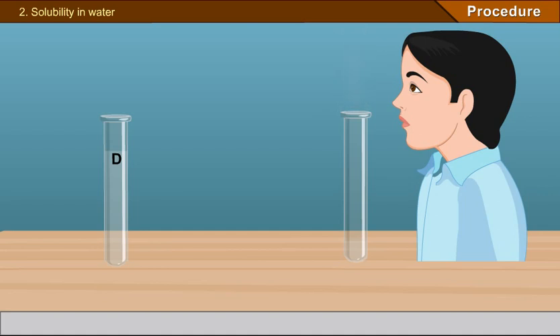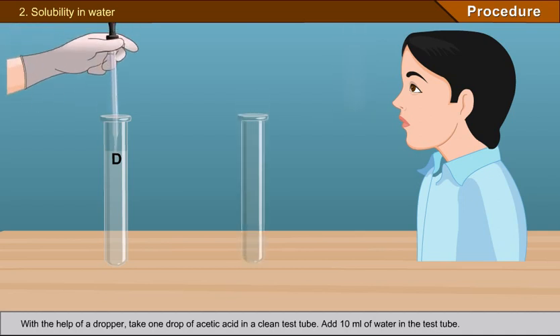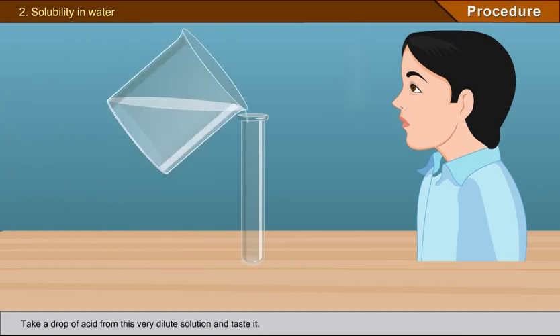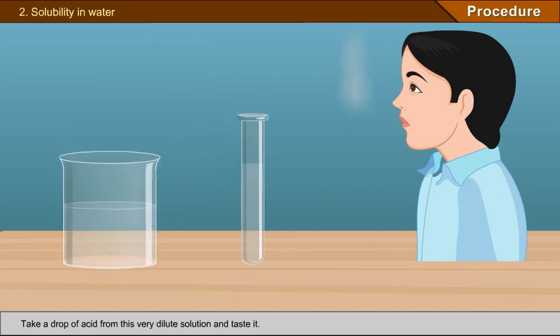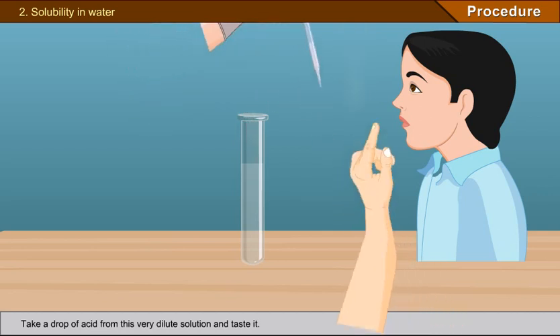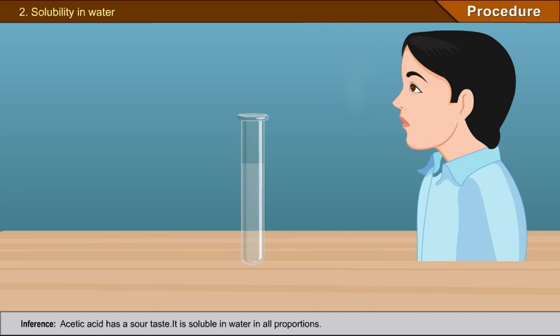Experiment 2 - Solubility in water: With the help of a dropper, take 1 drop of acetic acid in a clean test tube. Add 10 ml of water in the test tube. Take a drop of acid from this very dilute solution and taste it. Observation: it has a sour taste. Acetic acid dissolves in water. Inference: acetic acid has a sour taste and is soluble in water in all proportions.